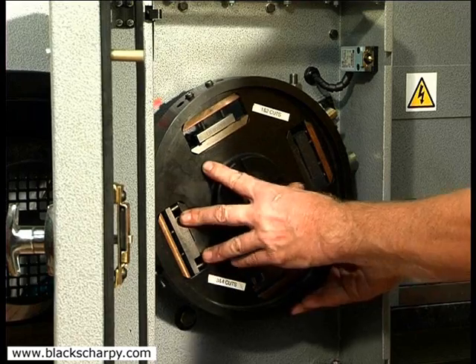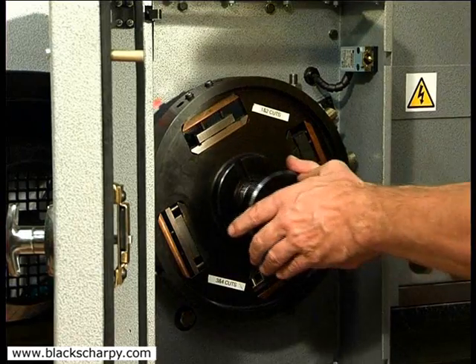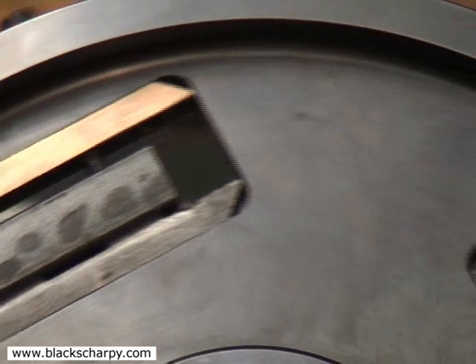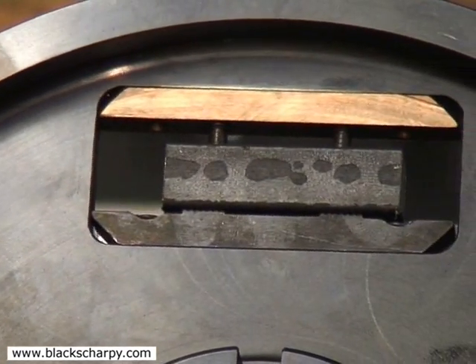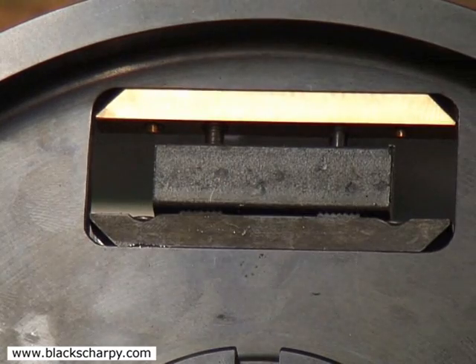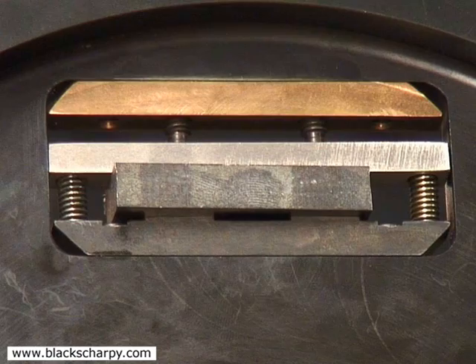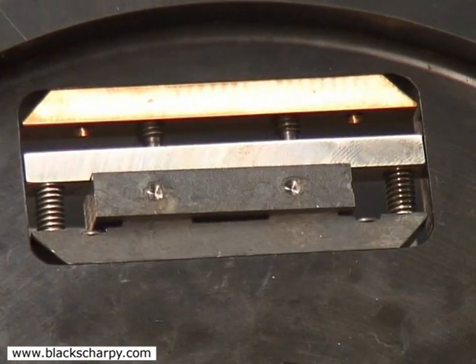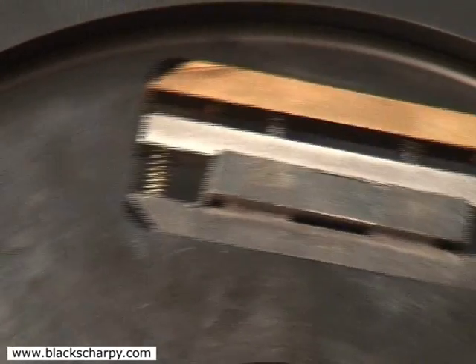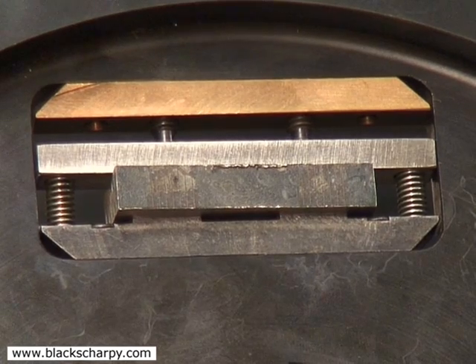A fixture set up with two specimens in first and second cut pockets and two specimens in third and fourth cut pockets is shown. To speed up production, additional fixtures can be purchased. For example, a fixture can have four specimens in first and second pockets, and a second fixture can have four specimens in third and fourth pockets. Whilst one fixture is being machined, the other fixture can be unloaded and loaded, so there is no lost time for clamping the specimens into the fixture.